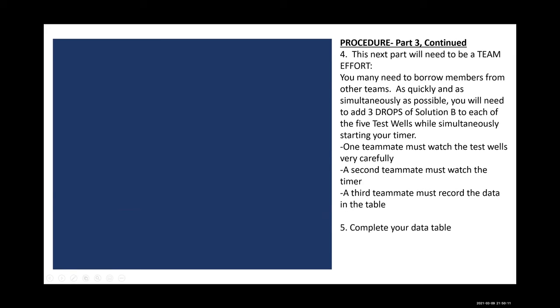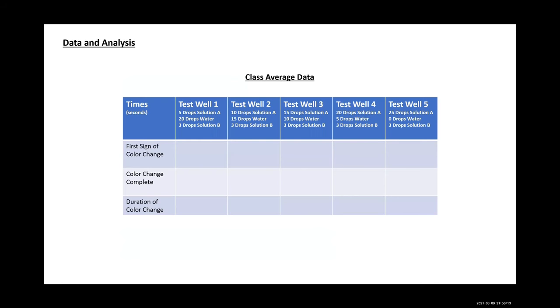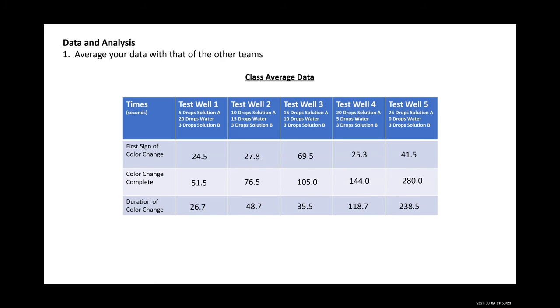Lastly, complete your data table. So here's our data table, and these are our class average figures. So let's chart it, make it a little easier to see.